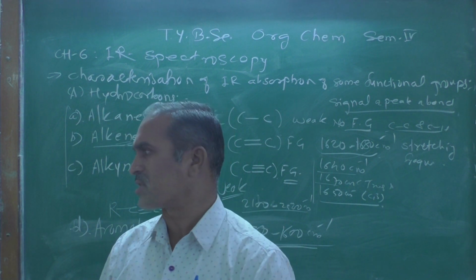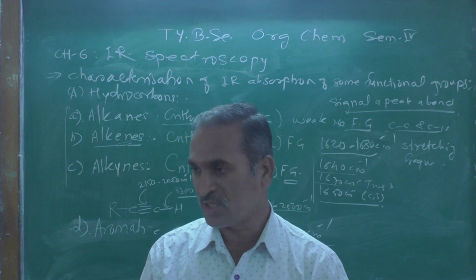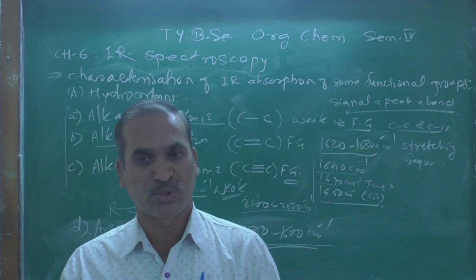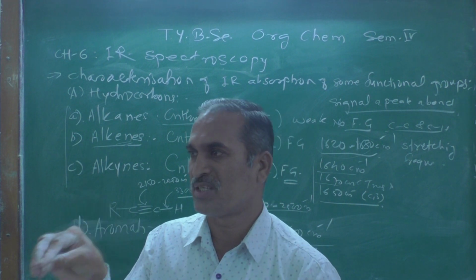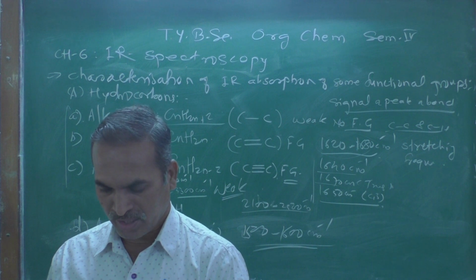It is a very characteristic, prominent, significant peak, and clearly indicates the presence of an aromatic compound in the organic compound.